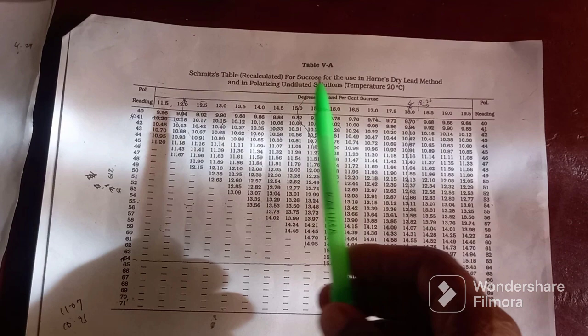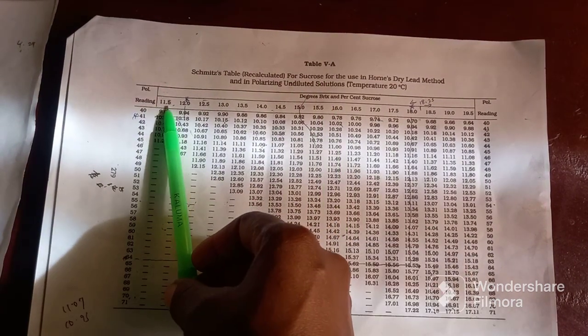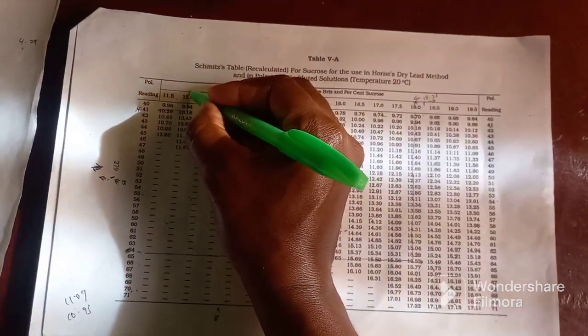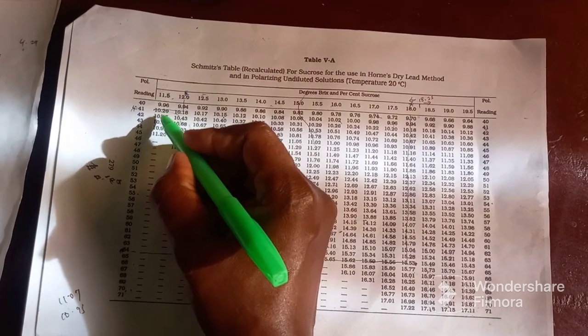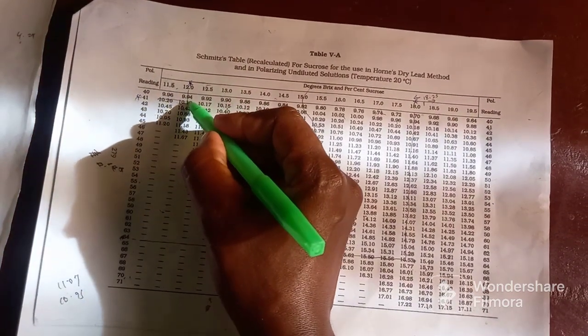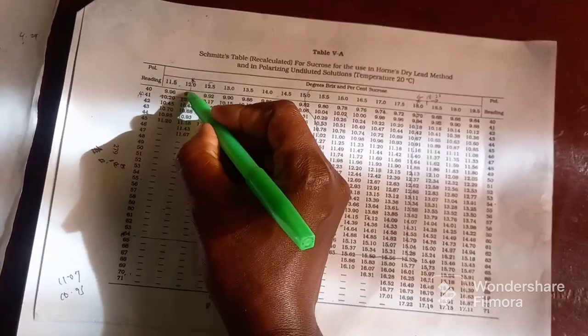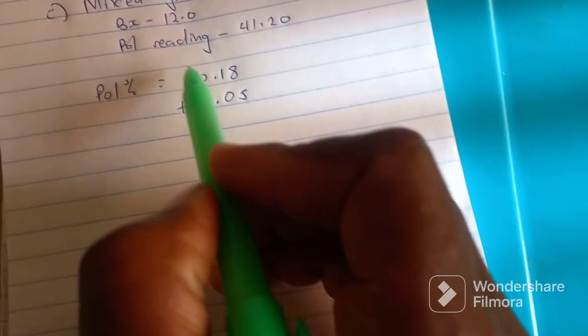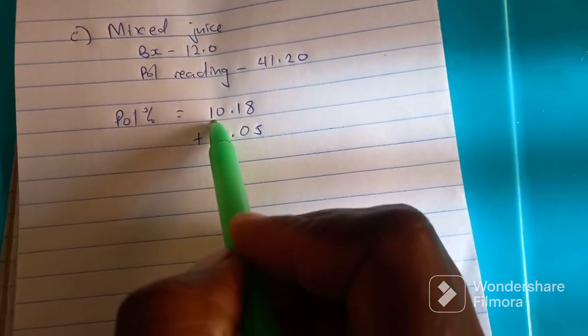I've said Brix of mixed juice is 12, so let's see where 12 is. Yes, it's here. And pol reading is 41.2. So our 41 is here. So the value that's between 41 and 12 is 10.18. So you record 10.18. And remember, pol reading, I said, is 41.2.